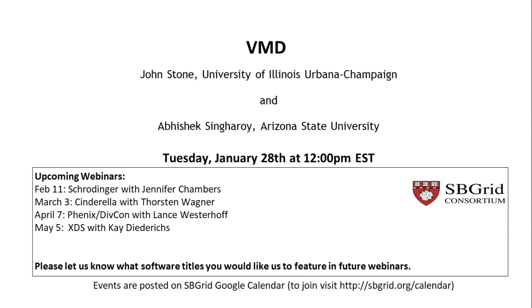Cryo-EM is steaming ahead, you know, the single particle reconstructions, but cryotomography is really kind of lagging. There are people who are looking at determining structures in cells or in the context of cells, and to do this, they need to have some sort of automated way to recognize compartments and particles and do segmentation. You talked a bit about the containerization and the segmentation in VMD. Is that something that's on your radar or in the workflow for VMD right now?